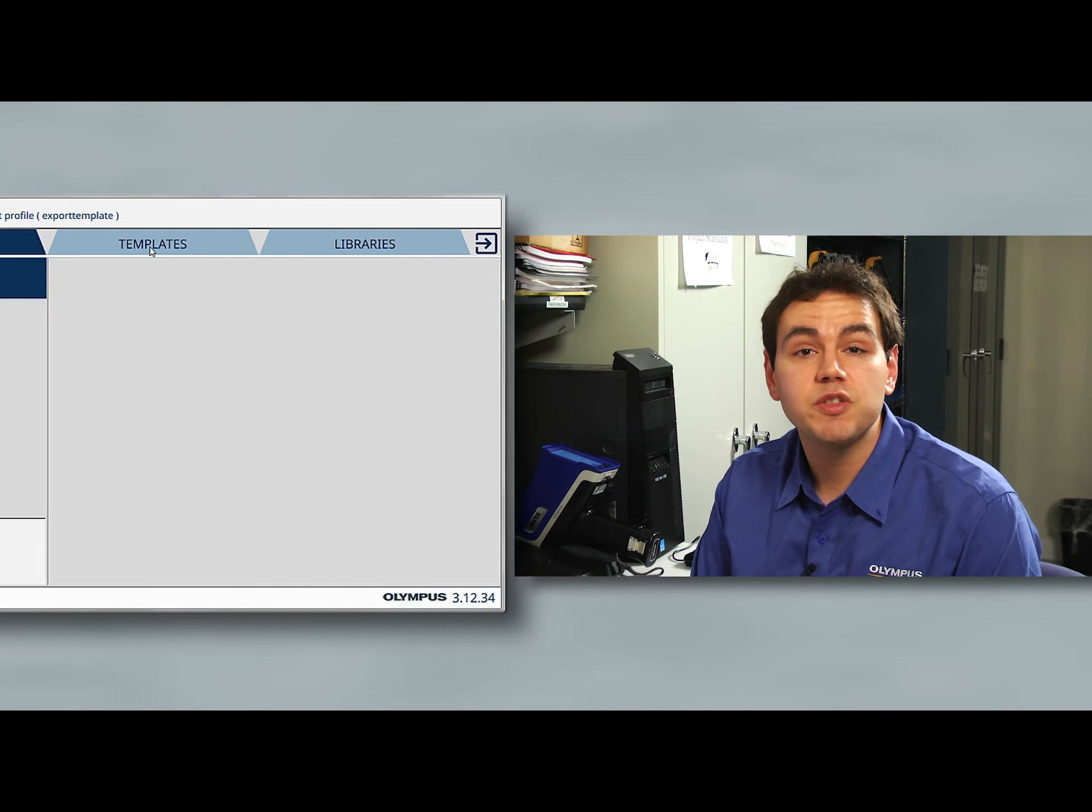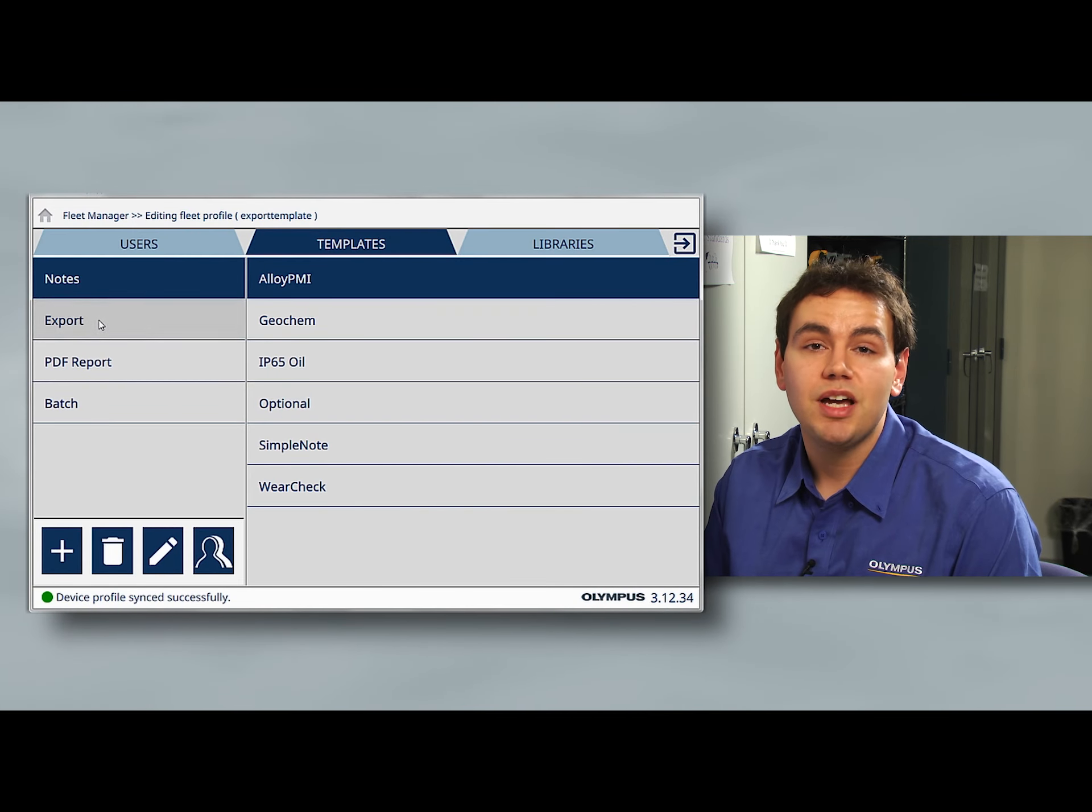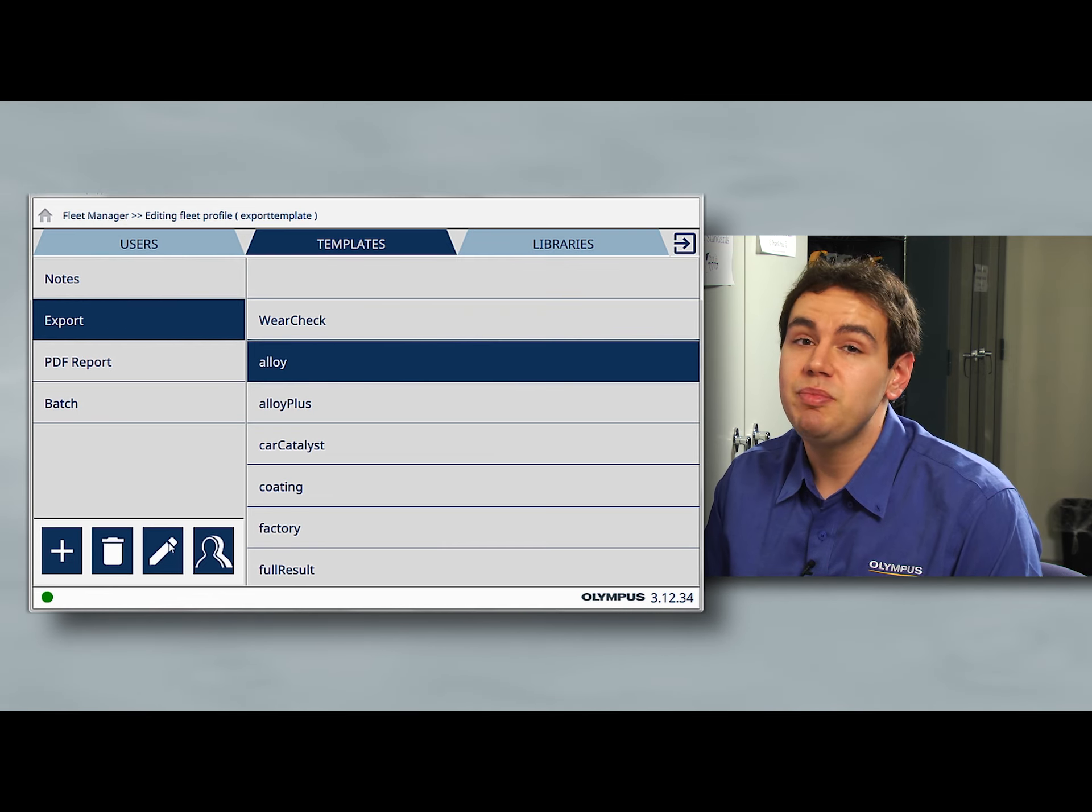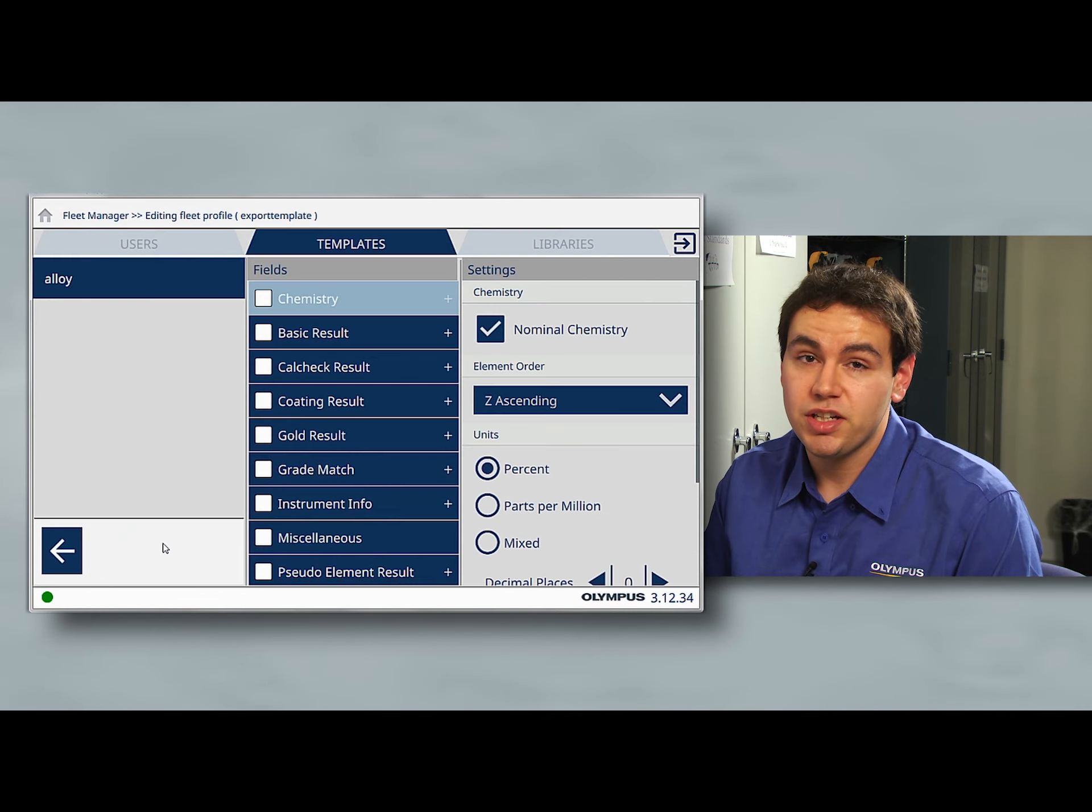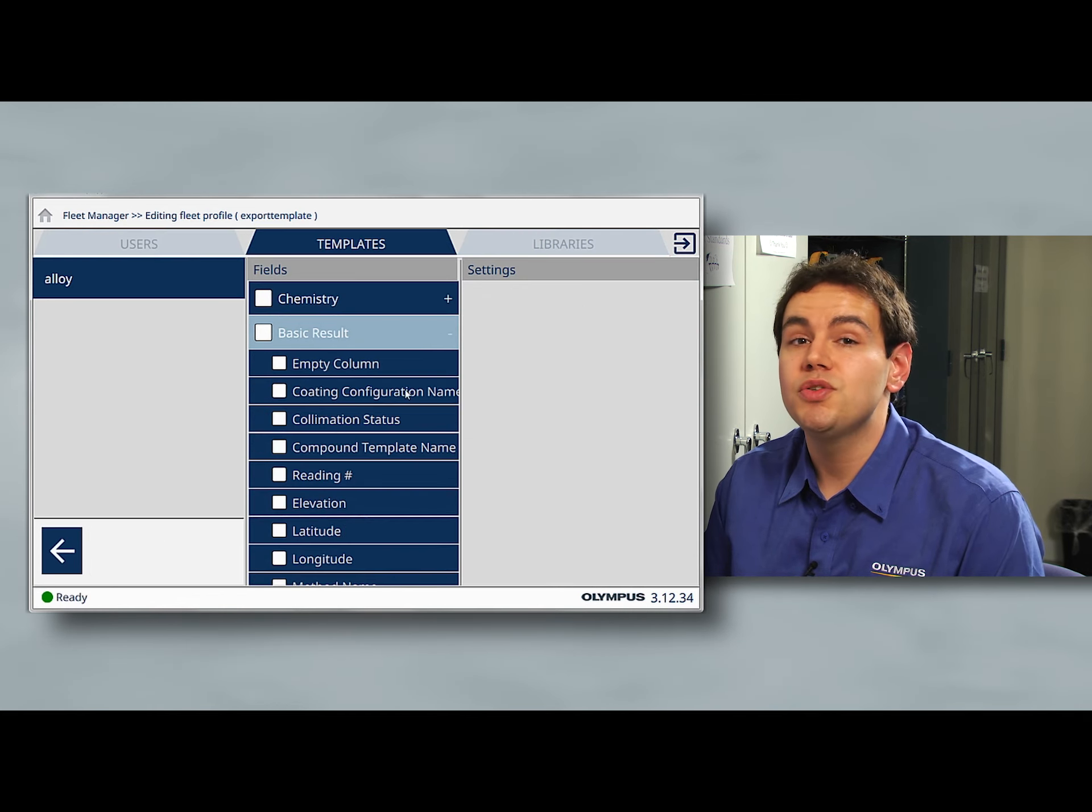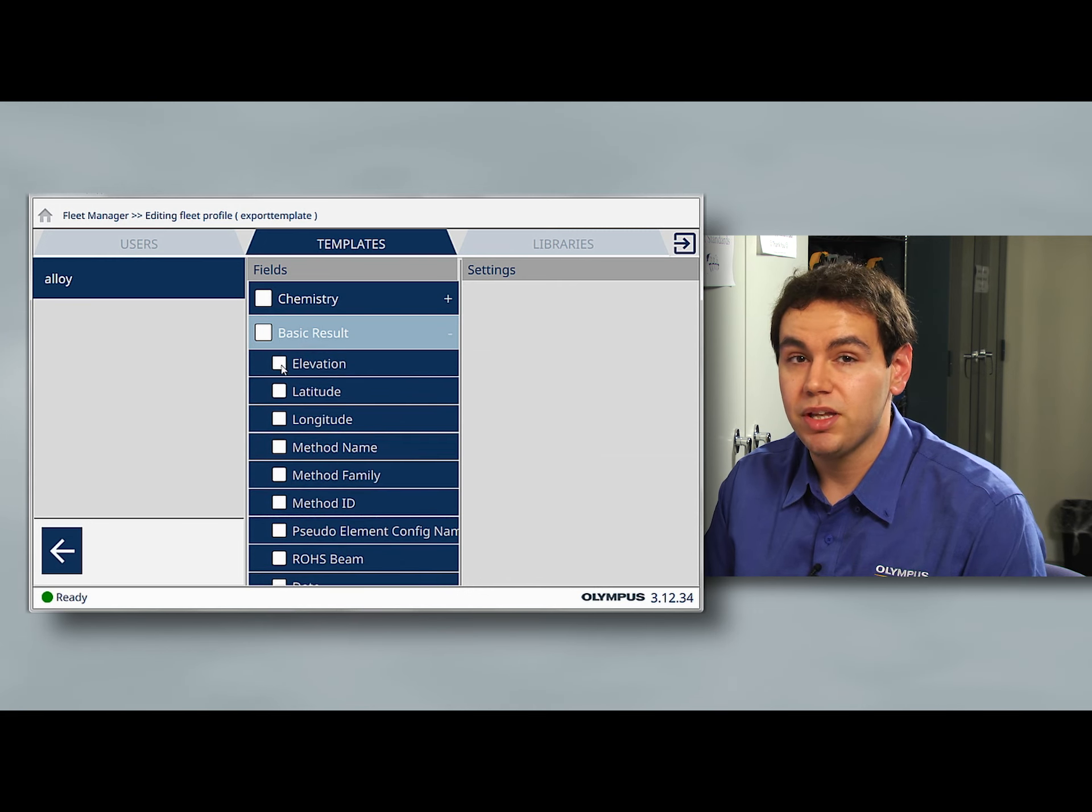The latitude, longitude, and elevation can all be exported as well. This can be done using any export template by checking the GPS information in the fleet manager. Once you select this for the export template, the GPS information will be exported for any samples collected while the GPS is on.